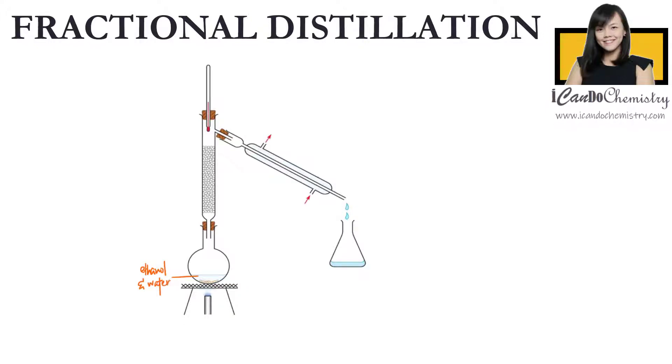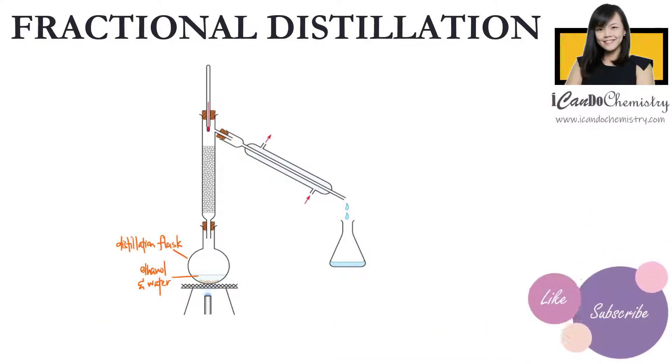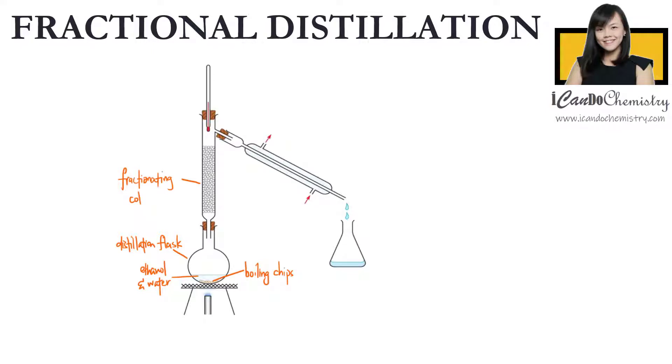We have the distillation flask with water and ethanol inside, and inside we have boiling chips. This long column here is called the fractionating column, and inside there are many glass bits.